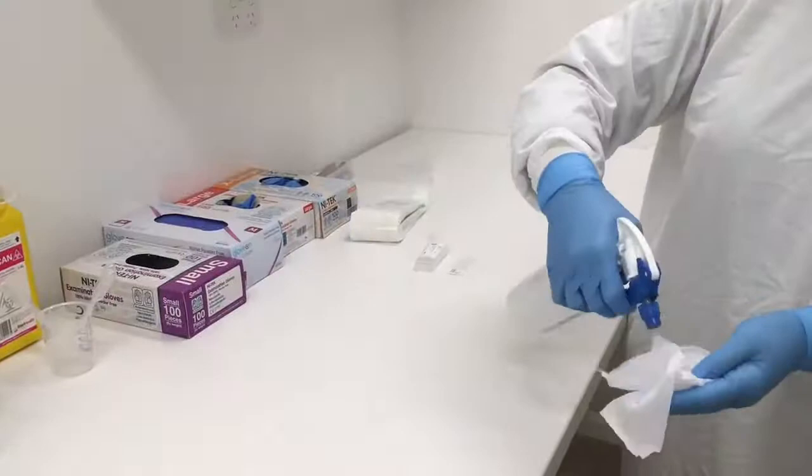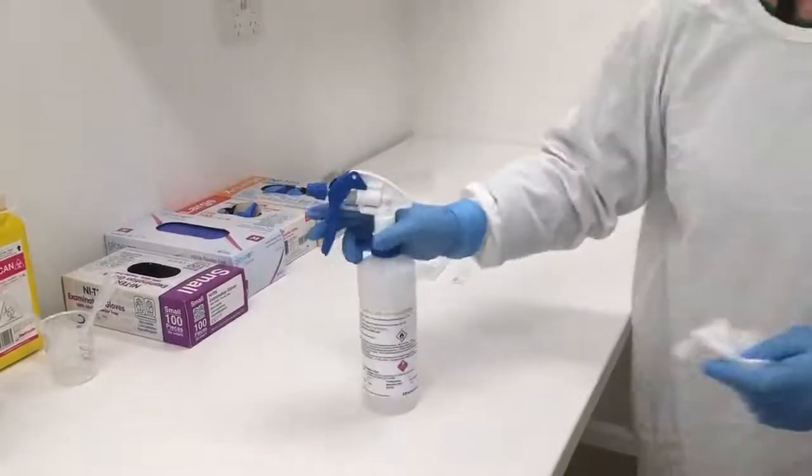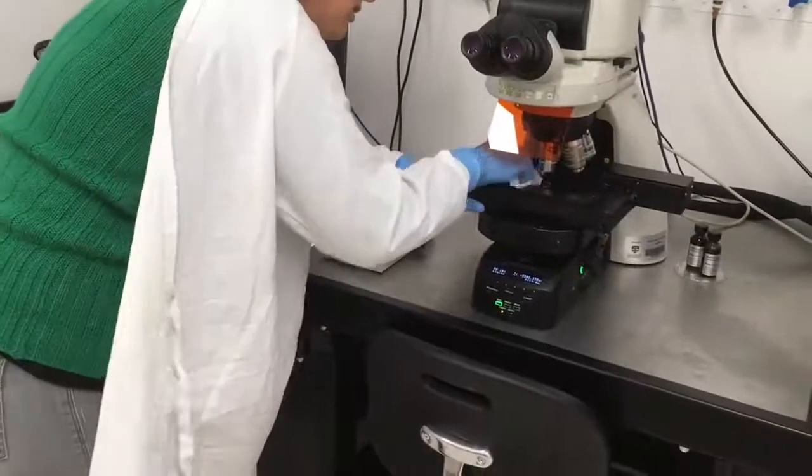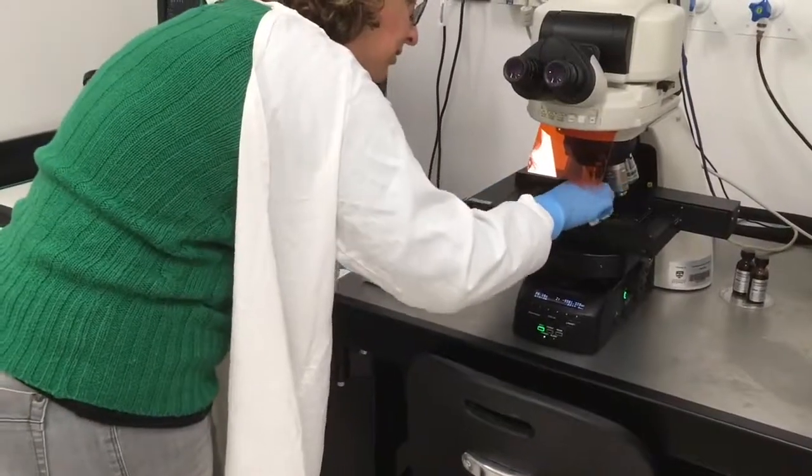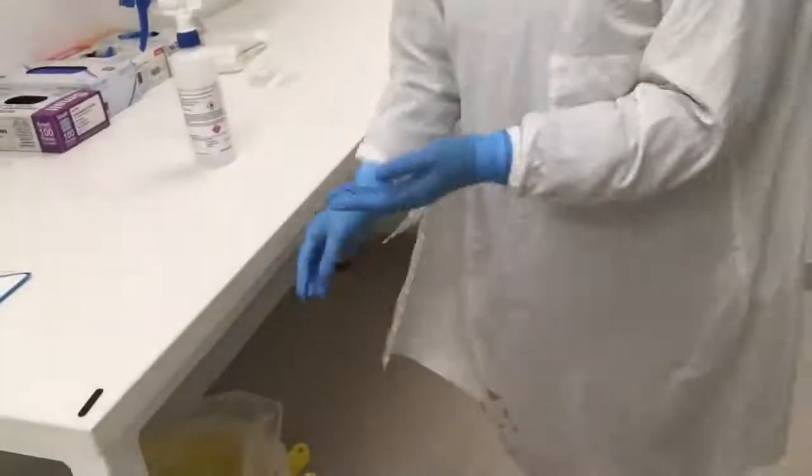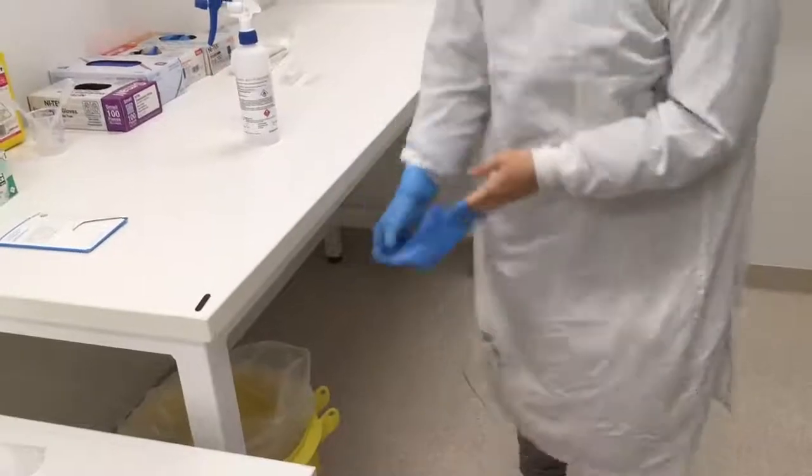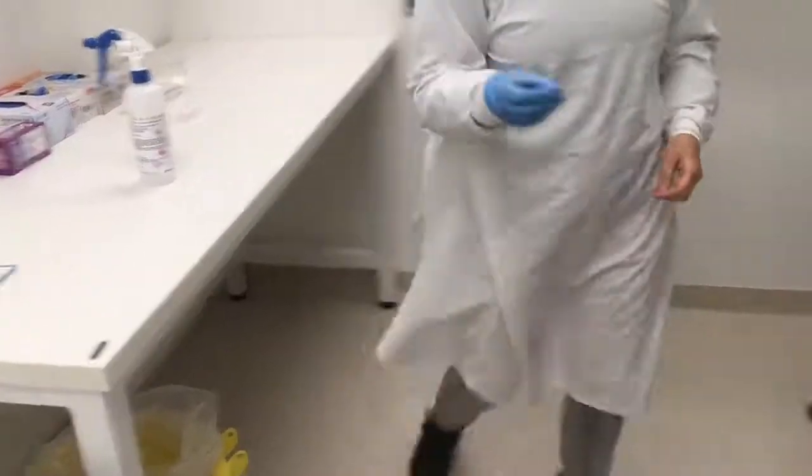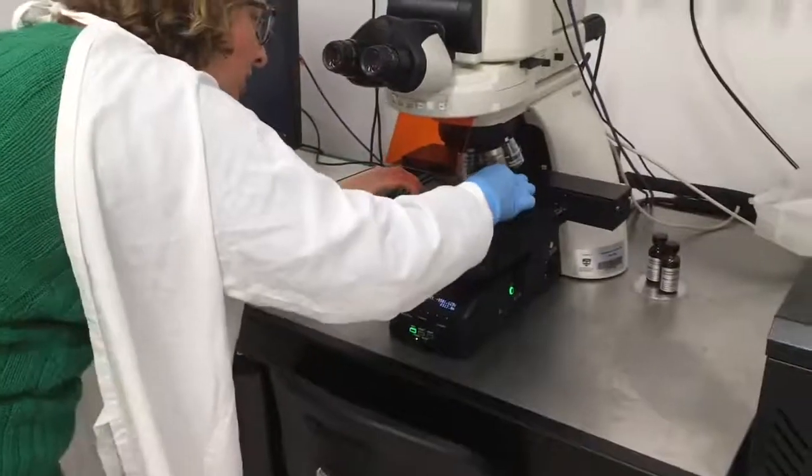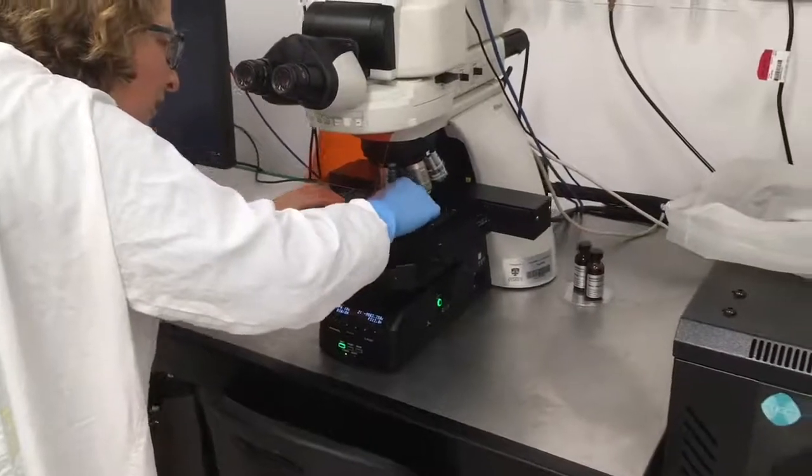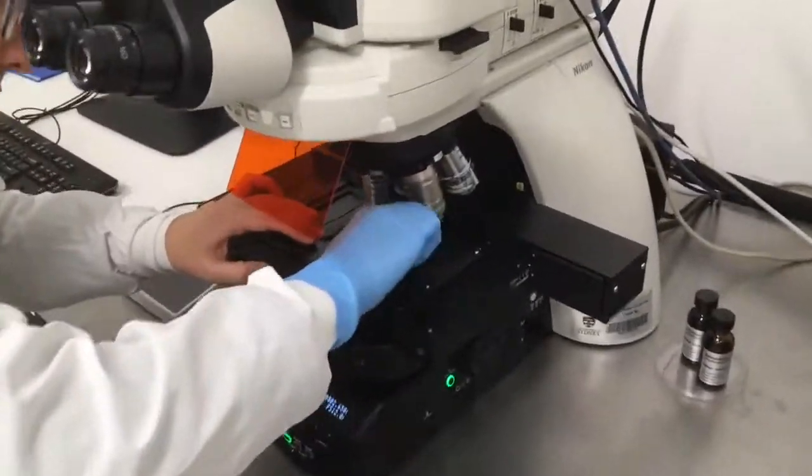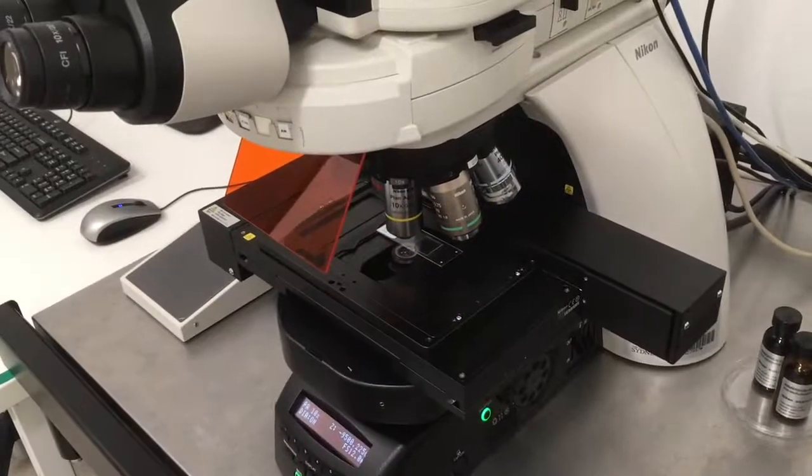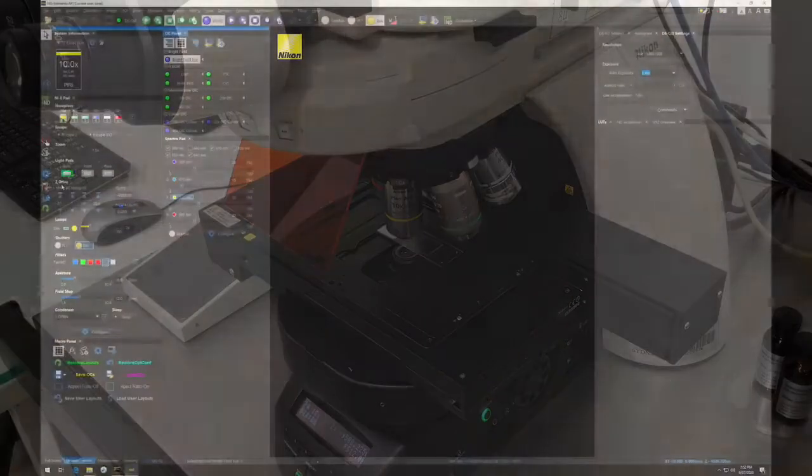Use 80% ethanol and a kimwipe to clean the stage. Dispose of the kimwipe and gloves in the biohazard waste bin. Now place your sample on the stage, being careful to make sure it is flat. It is very easy to accidentally put the sample on at an angle, so double check to make sure it is flat.